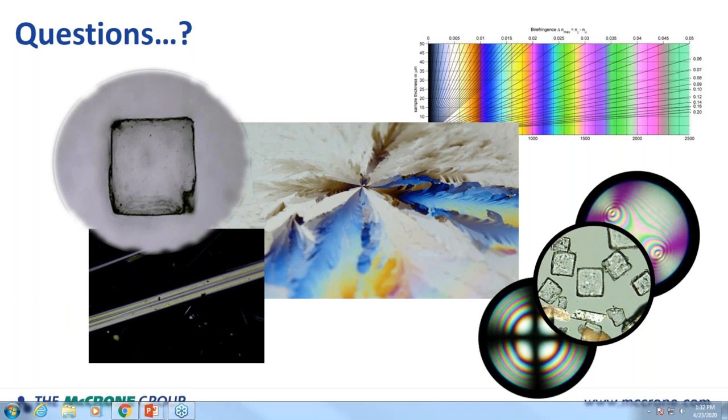Okay. Lots of questions rolling in here. Chris is saying, I have a fixed XY stage. Can I use it with the polarizer and rotating the analyzer? I think he's using a biological microscope there, Tom.